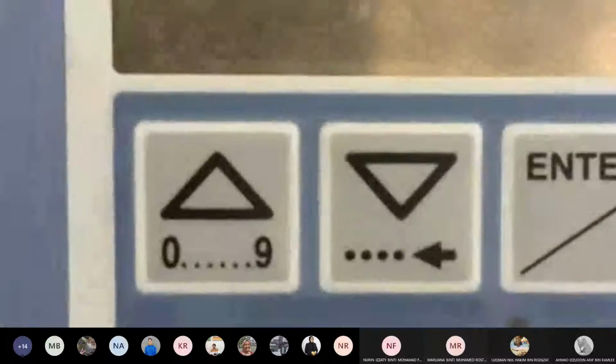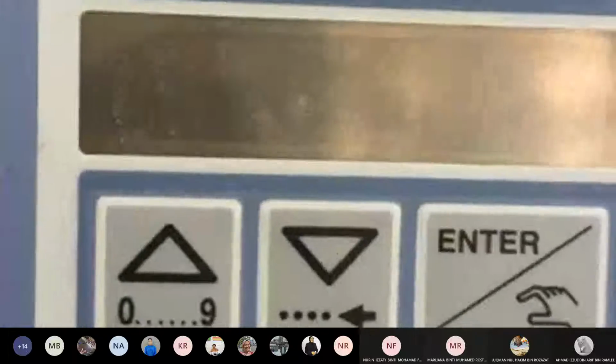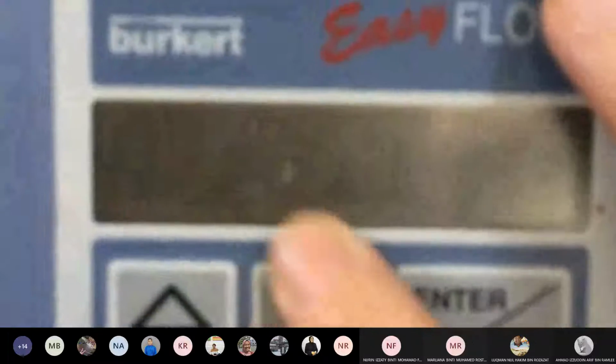Okay, sebab dia sedikit any problem especially pump, kalau macam contohnya if your pump, katakan kita set je, saya switch on balik. Okay, kalau kamu perasan, let's say saya adjust flow rate. Okay, so harap kamu boleh baca. Kamu kalau boleh nampak kan, flow rate dia fluctuate, right? Saya dah tak kacau flow meter tau, saya dah tak kacau watt, tapi flow rate dia fluctuate. Faham tak indikator masalah dia? Masalah dia bila saya set katakan 80 ml per minute, tapi dia tak constant 80 ml per minute. Kamu tengok dia fluctuate. Kejap 80, 81, 82 kamu boleh nampak.